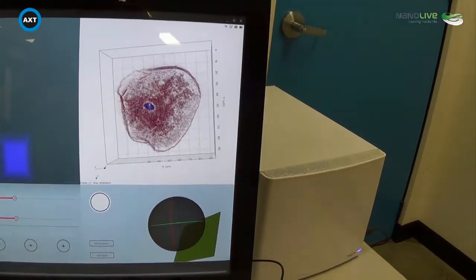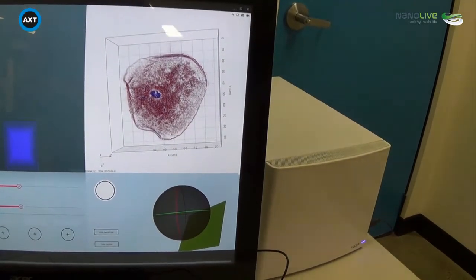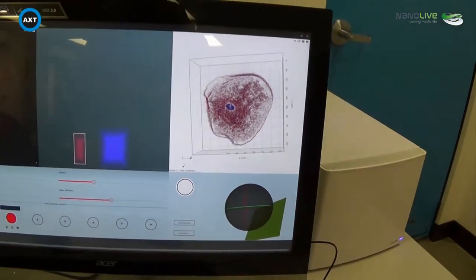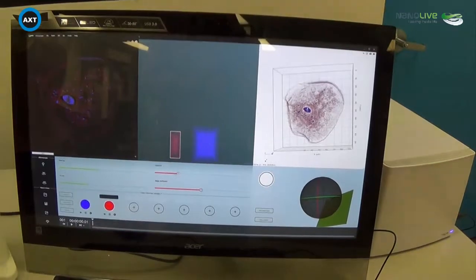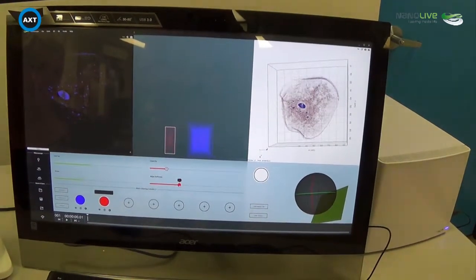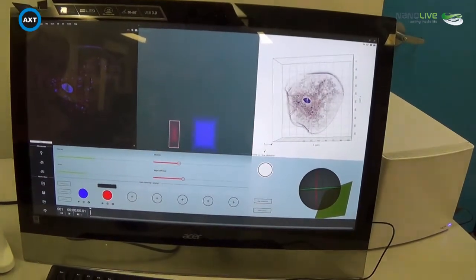And you can adjust the dyes, the stains, for clarity and for opacity. So if you wanted to turn down the red, for example, we can do that. And then we're able to see the nucleus more clearly.